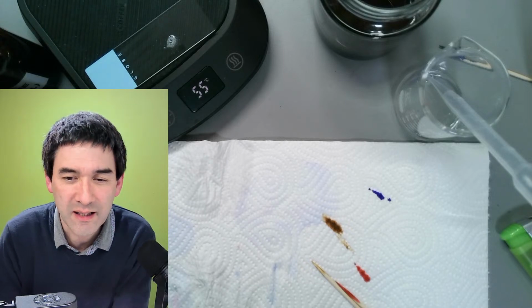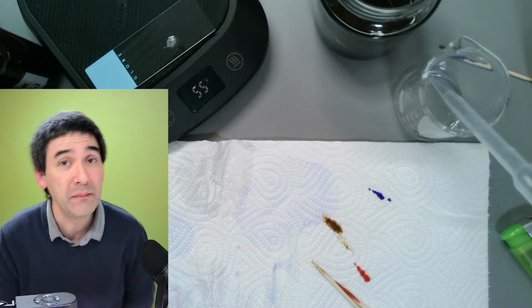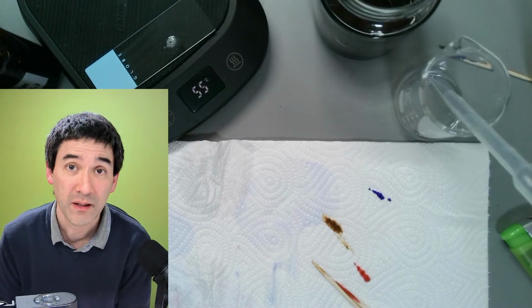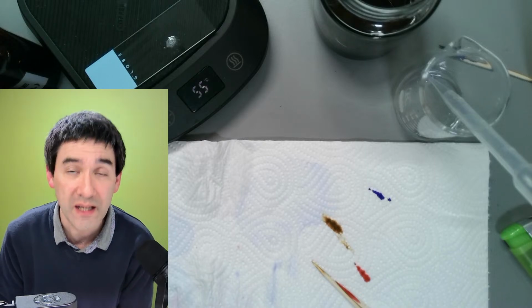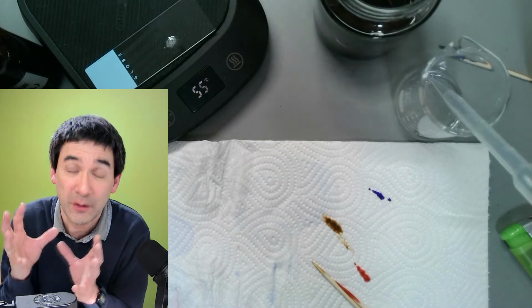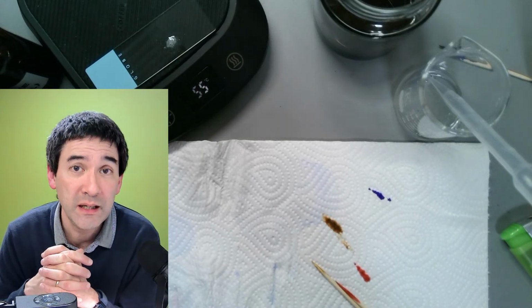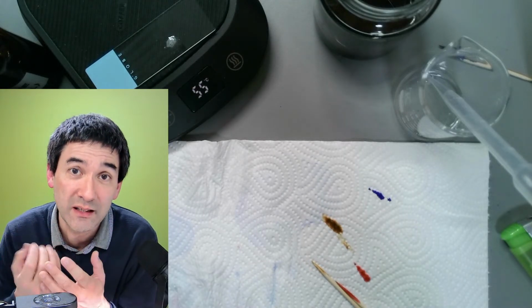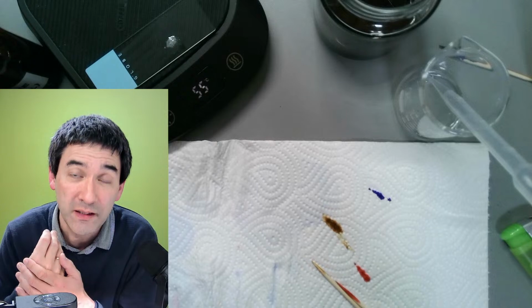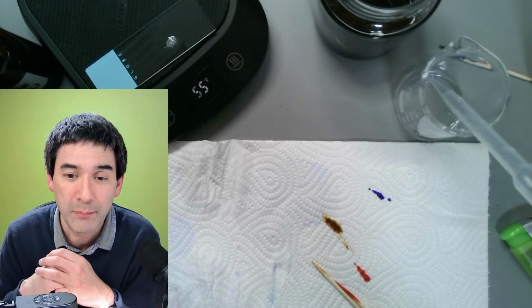Would epithelial cells color and bacteria differently? I don't know. Honestly, that's a good one. I can imagine that maybe the body cells will not retain the stain because they don't have a cell wall. I would guess. I don't know. But in any case, Gram, the guy, he tried to actually use the staining technique to make bacteria specifically visible. So I can imagine that maybe the body cells do not stain gram-positive.